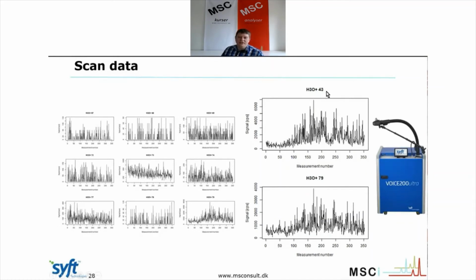That's a pretty generic ion, so I'm not sure what it was, but we could see it and then analyze for what it could be later. Where other data, as you can see here, it's pretty, either there's not much signal or it's just the same noise all the way through.